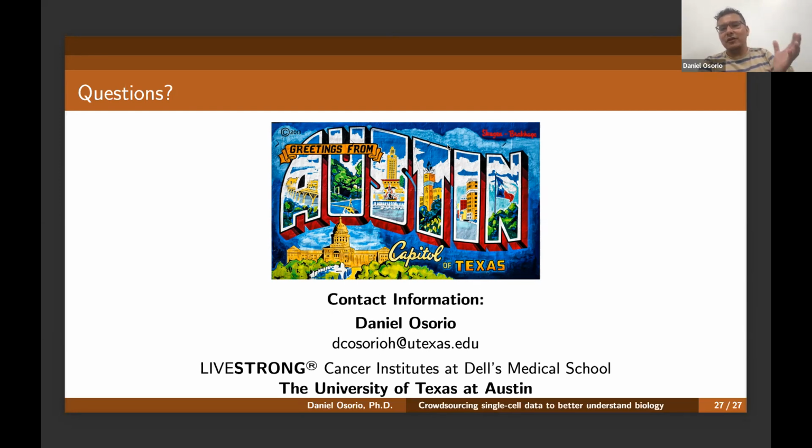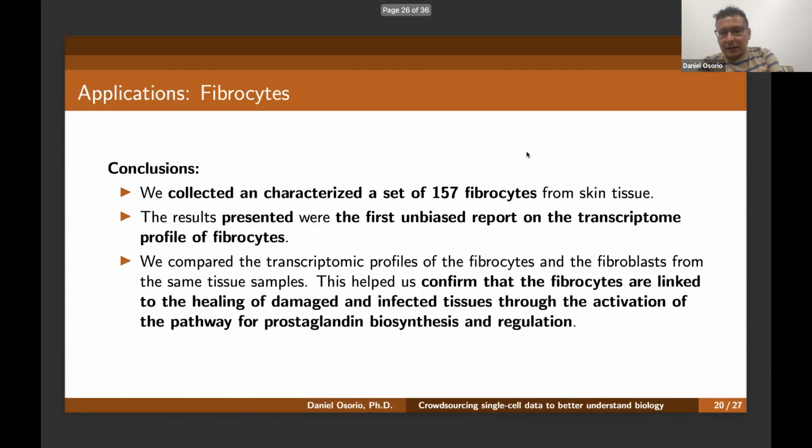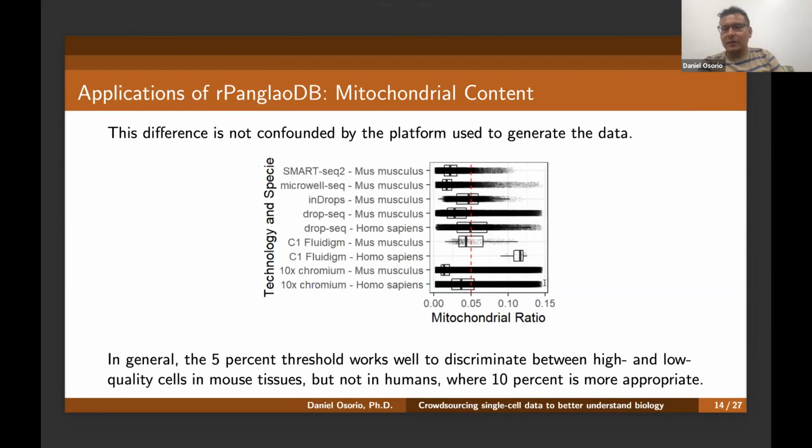That was done before starting to identify the patterns of the mitochondrial content, and that is why the threshold here is set as a boundary of 15%. So none of the cells that failed the initial quality control was used in the analysis, and this helped us to better manage the range of the real mitochondrial content within the samples.